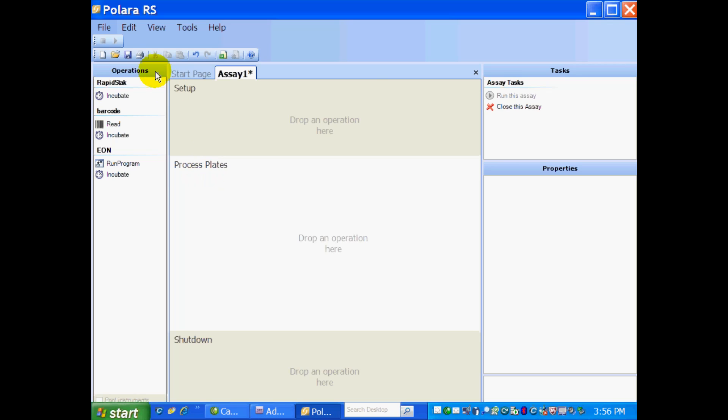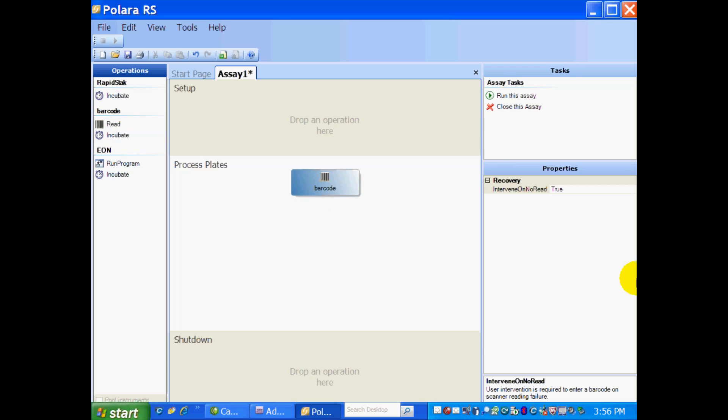All we need to do is drag and drop operations from the left-hand panel into the center panel. So to do that, I'm going to start with my barcode read. And now the Properties box becomes active.